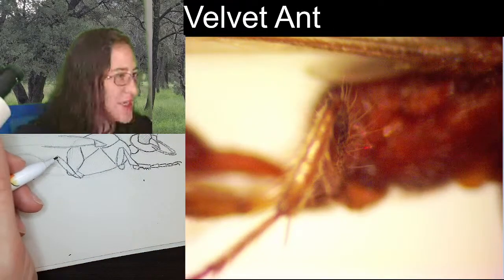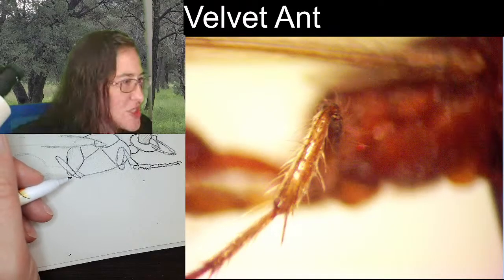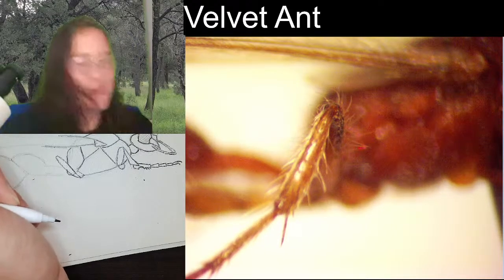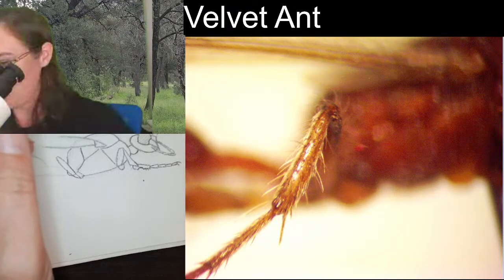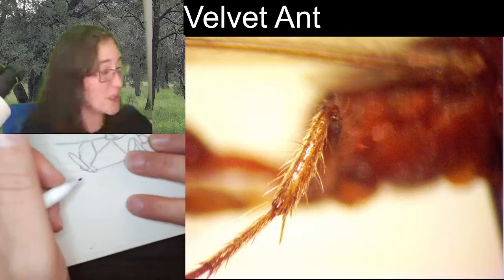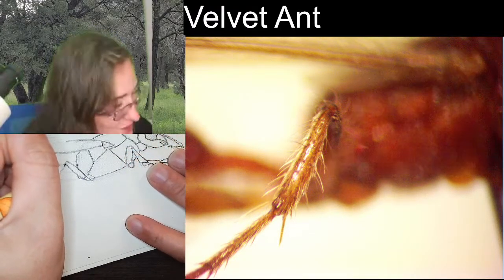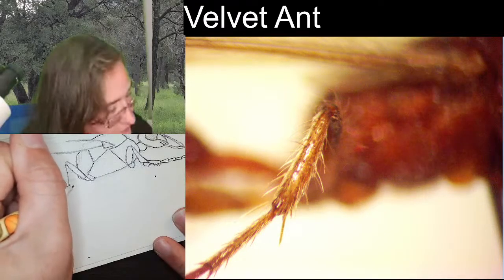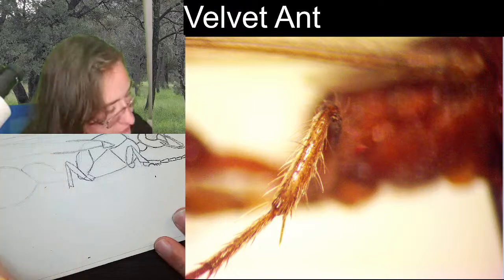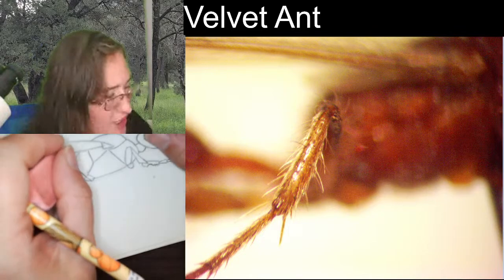And I'm going to zoom out a little bit so we get a little bit more of this picture of this tibia here. It does have, I want to say one, but it's probably two. It's only one from this view. One spur, spine, tibial spines. We love the tibial spines. I know we do. So this one is coming back down.